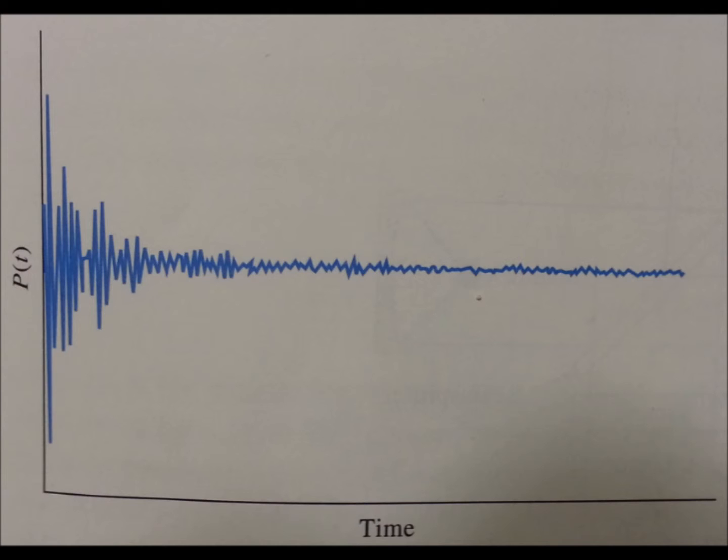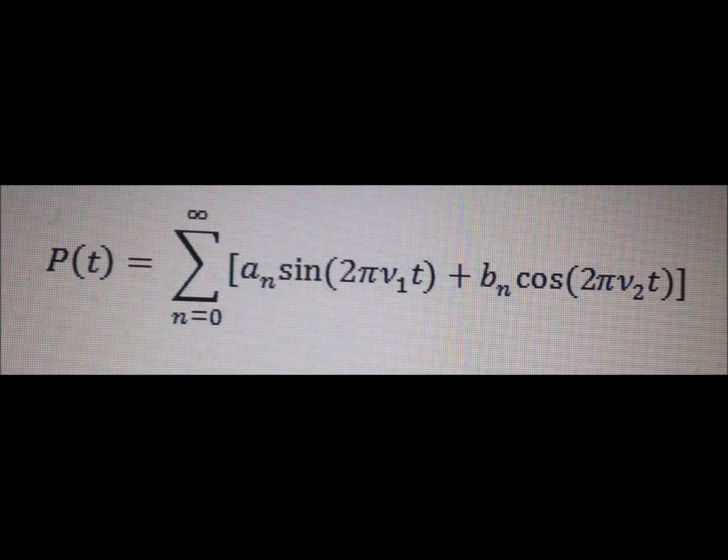Nevertheless, a time domain spectrum and a frequency domain spectrum can provide the exact same information. The entire time domain spectrum can be displayed all at once, thereby significantly decreasing the amount of time required to perform frequency domain scans. Thus, converting from the time domain to the frequency domain can result in highly precise and quick analyses, while still obtaining the necessary spectroscopic information from the frequency domain. This can be accomplished using a Fourier series, where a curve is decomposed into the sum of sine and cosine terms.